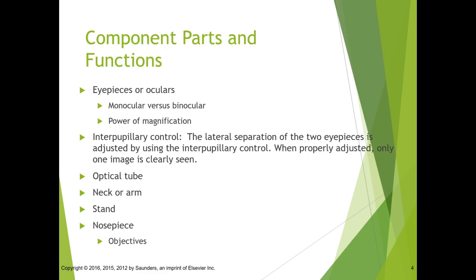A lot of students do struggle initially using the binocular. They start to complain, they see their eyelashes, that they can't look through two things at once. I recommend patience. Over time, you will not notice that anymore. Initially, it may drive you a little bit crazy, but bear with me. By the time we get to advanced hematology and microbiology, you guys are going to be complete experts in the microscope, and it will not be confusing to you.